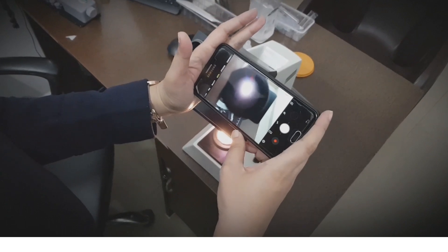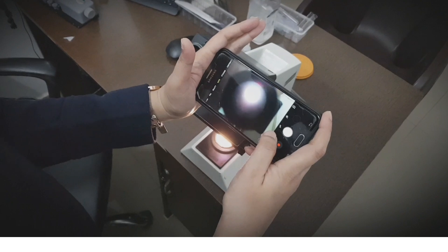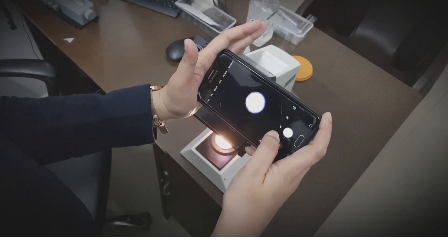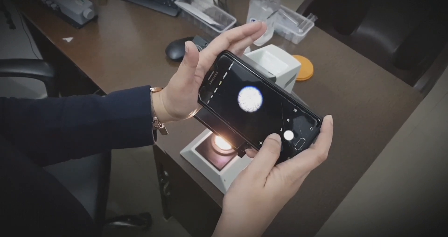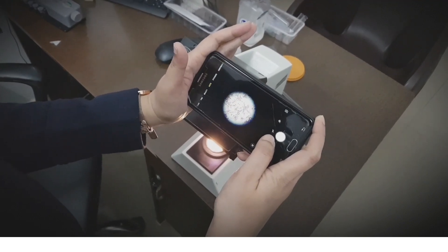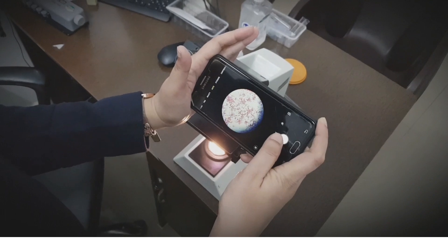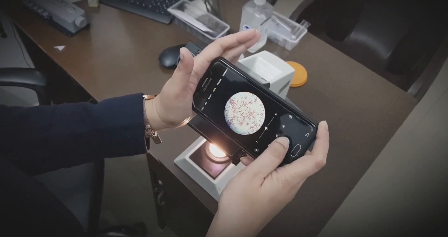Place your hand on the edge of the eyepiece so that your hand remains steady. Now try to focus the camera on the eyepiece such that your phone shows a white circle. Once you get a clear image, a full circle, take a deep breath, hold your breath to keep the hand steady, and click three times.